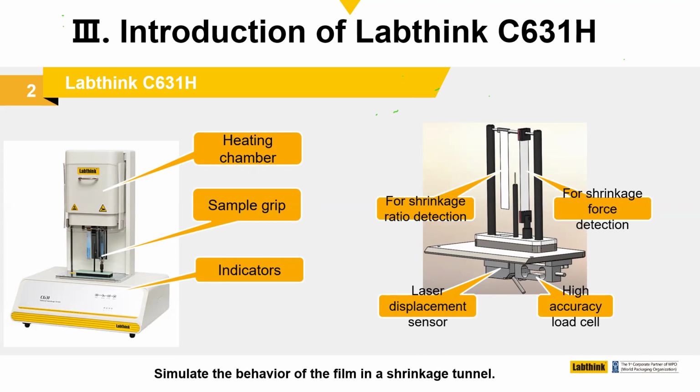The machine has its own internal computer for processing the data and for giving the machine its control instructions. And those control instructions and the visibility of the data are handled by an external flat screen monitor, a keyboard and a mouse, which is also included as part of the system.